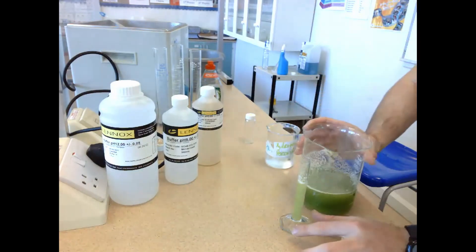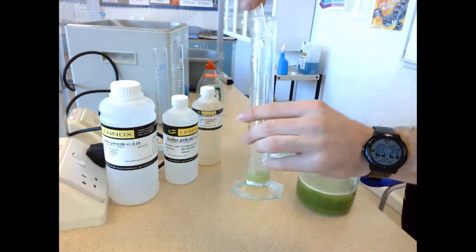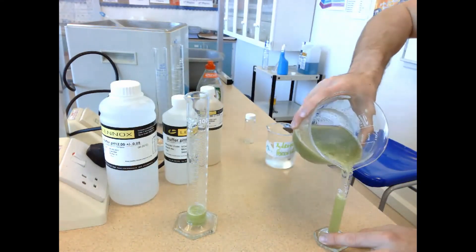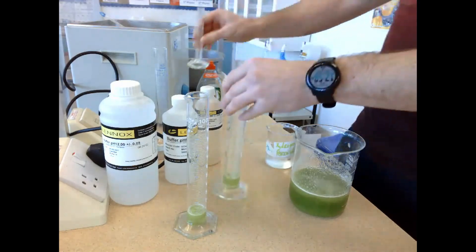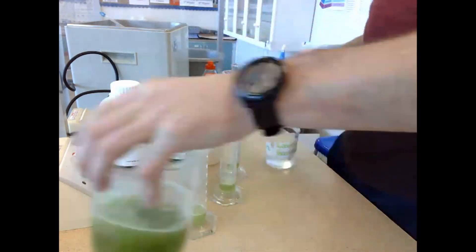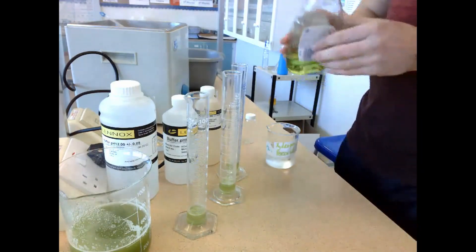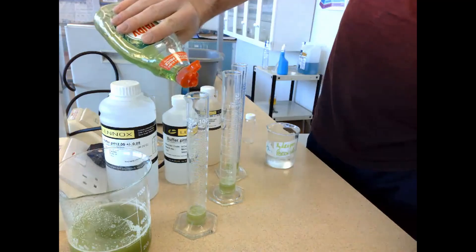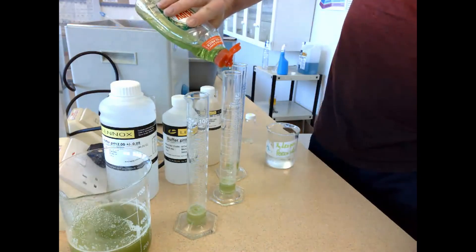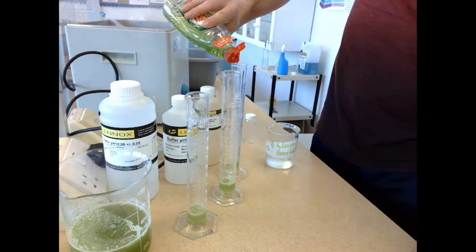I'm going to measure out 10 millilitres of celery solution and add it to graduated cylinder one, then do the exact same thing with graduated cylinders two and three. Once I have measured out 10 millilitres into all three, I'm going to add in some washing up liquid, which is going to trap the oxygen to make foam. That foam volume per minute gives us a direct correlation to enzyme activity. You can see I'm adding a few drops of washing up liquid into each of the graduated cylinders.